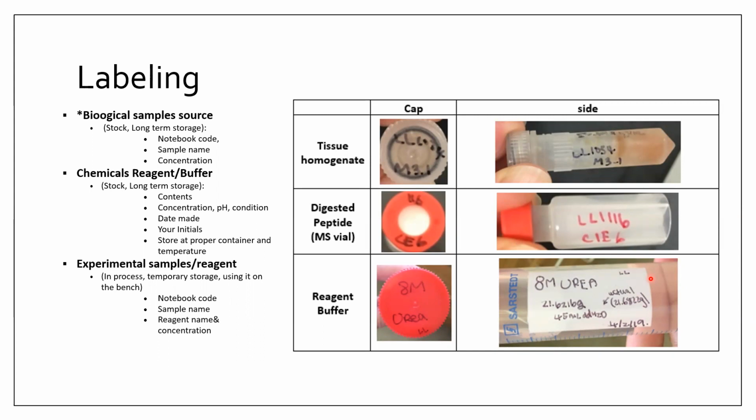And if you have a reagent on the bench that is not labeled, is not clear, and is out of date, it is guaranteed to be discarded by the cleaning people. So if something is precious, make sure you label it clearly and store it well, in a proper container, and we're going to talk about that in a bit.